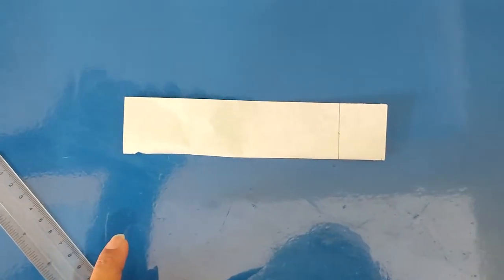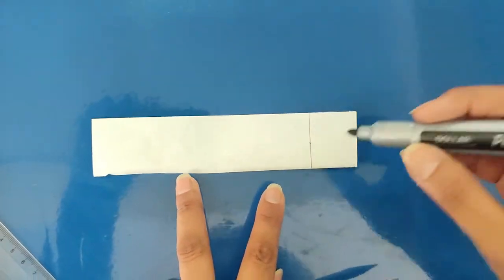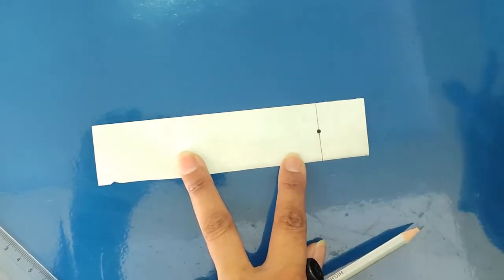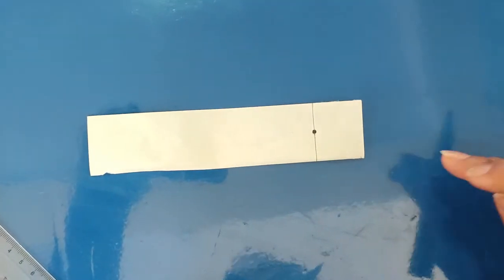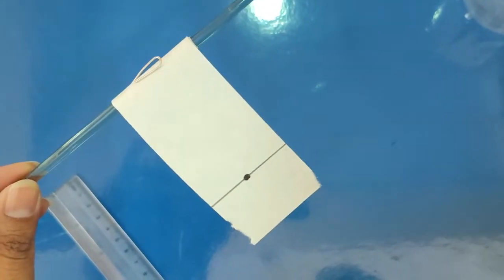In order to check whether it is a mixture or a pure substance, we are going to identify different colors on it. I will mark this point on it. After this, I will take this paper and place it on the chromatography apparatus. After setting this paper like this, we will start our experiment.